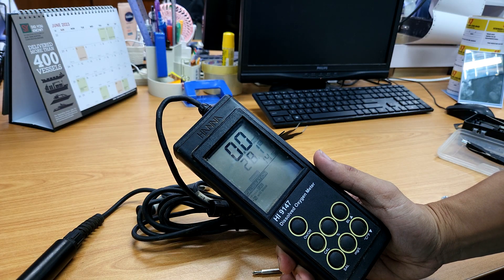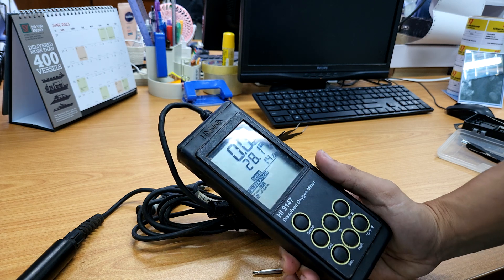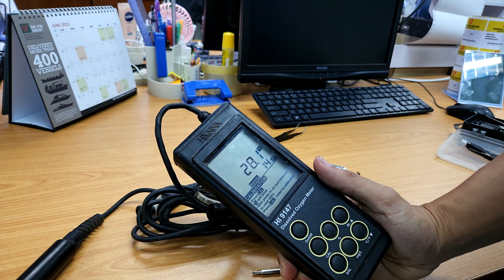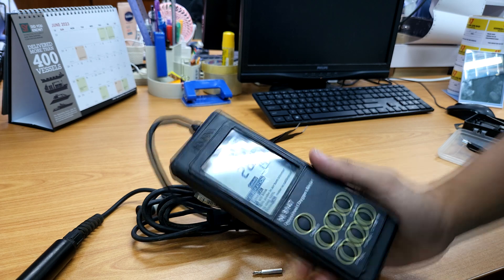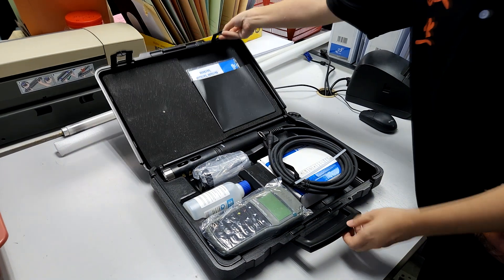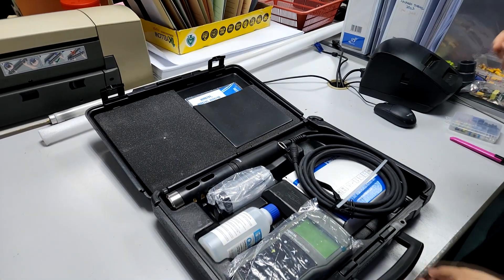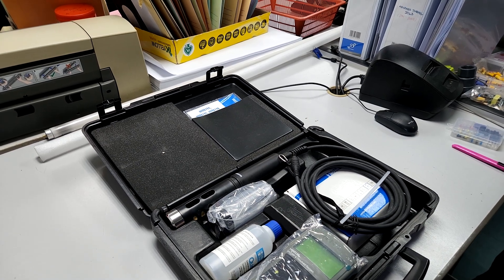In the past we've shown everybody we were using an older HANA probe, a previous model, and we actually had a lot of problems with it because some of the telemetry between the probes and the body had issues. Despite sending it back multiple times and still not having the issue fixed, we decided to top up the price difference between the old probe and this new one to get a better one.